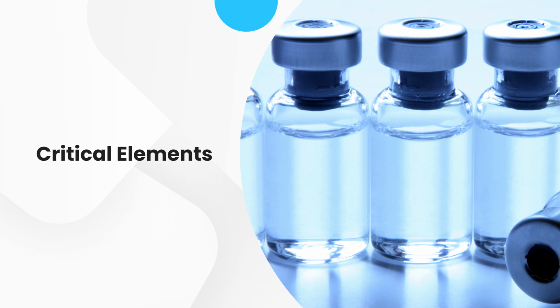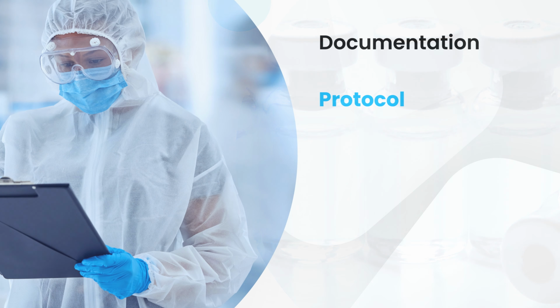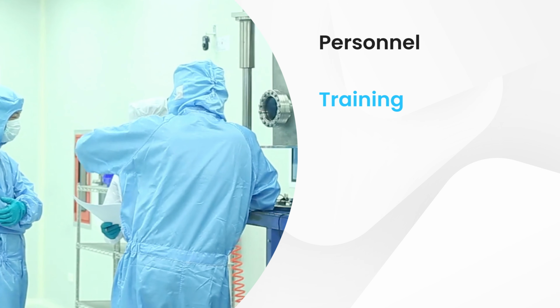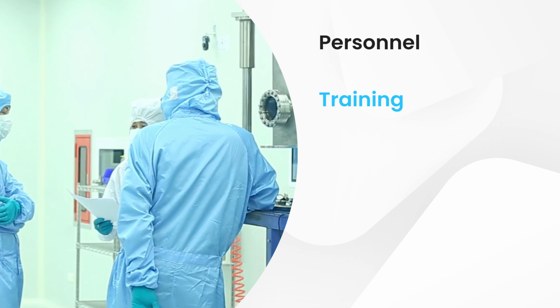Several critical elements are crucial for the success and validity of aseptic process studies. Firstly, a detailed protocol must be in place outlining the study objectives, procedures, materials, and acceptance criteria. The simulation should accurately reflect the representative conditions of routine production, including the duration of the process and any planned or potential interventions. Qualified and trained personnel must perform the study, adhering to strict aseptic techniques.